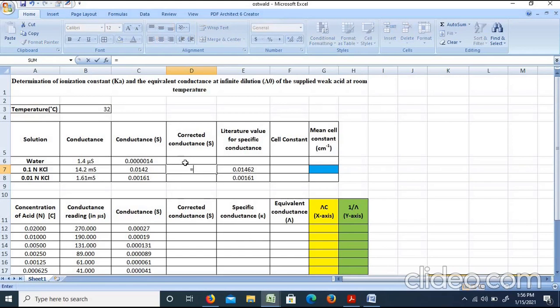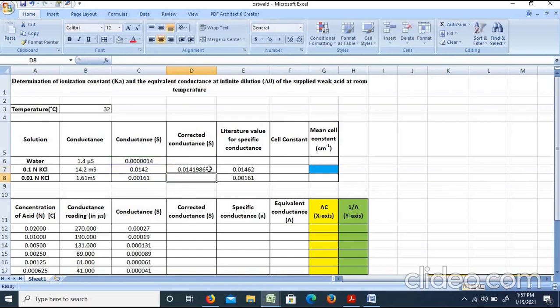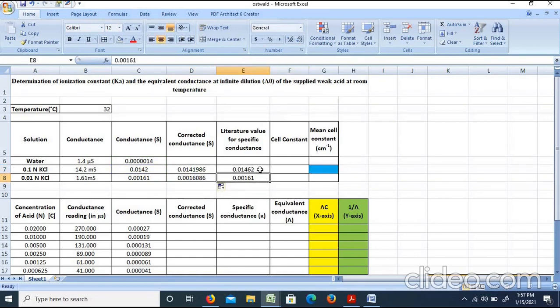Next, we can do the water correction — we subtract the water conductance value. We can subtract the constant value and use the corrected conductance. The KCl solution corrected conductance value is compared to the literature value, which is the supplied standard value.